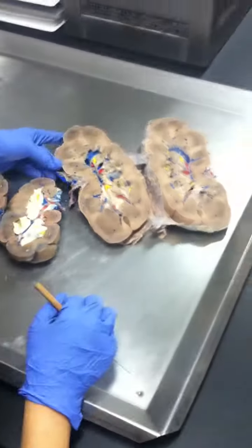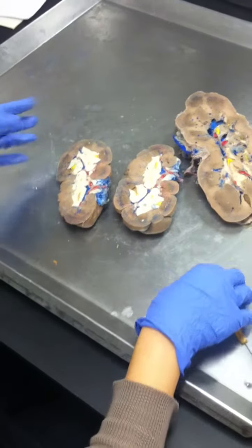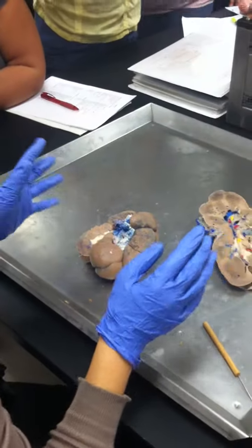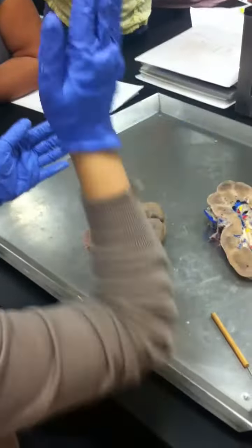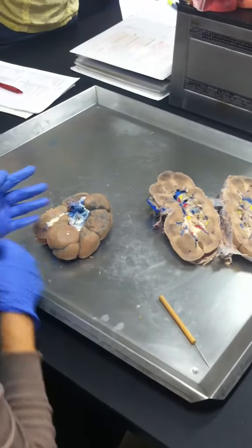What else do I want to point out? Oh, well, it's also good to realize that when you open up a kidney, it doesn't always look like that. Remember, the pyramids are in three dimensions, right? They're not just vertical like this, but they're like a big tree. So when you become real professionals in your field, keep that in mind. Remember, it's not only on one plane, it's 3D, right? Renal pyramids are everywhere, okay?